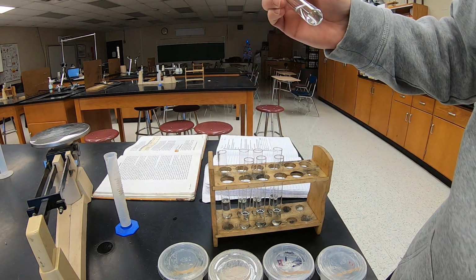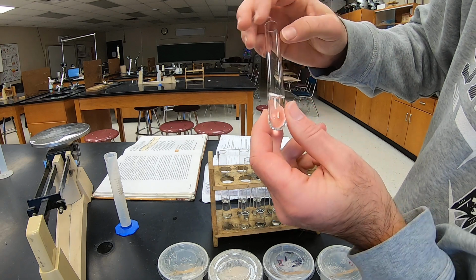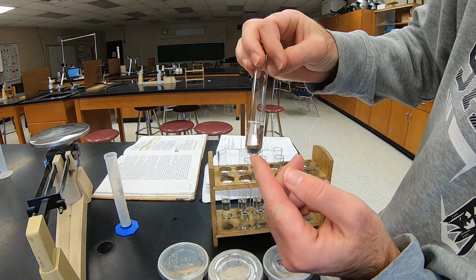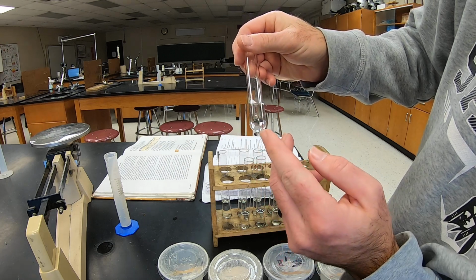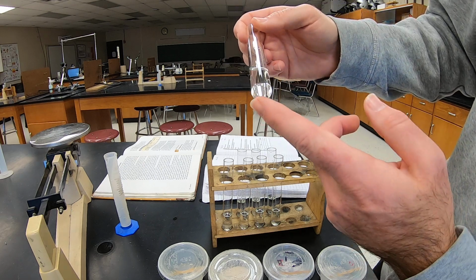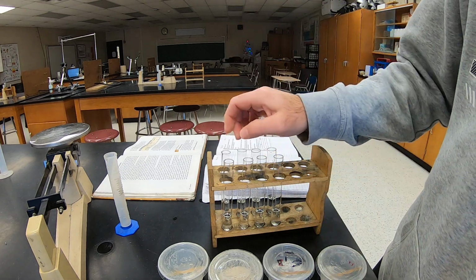Okay, sugar and rubbing alcohol, and it's going to be kind of hard to see on the video, but there is some sugar left at the bottom of this, a few crystals. So it did not dissolve. The sugar and water, there's nothing in the bottom, so it did dissolve.